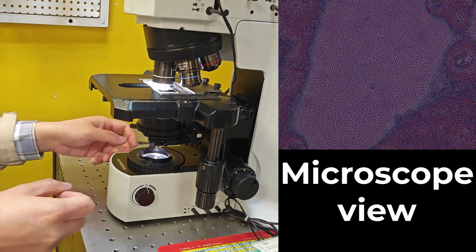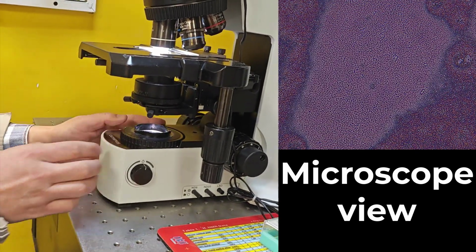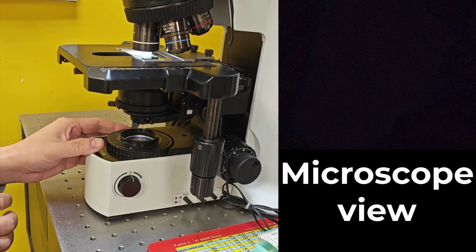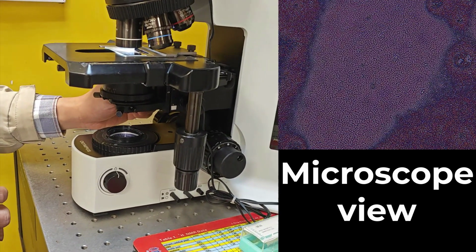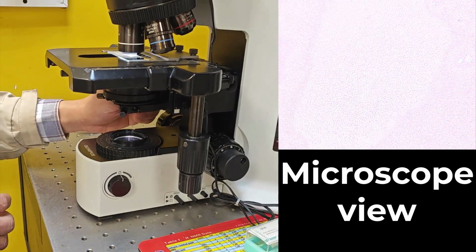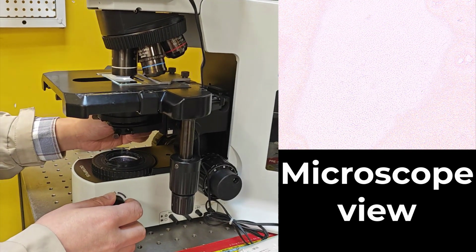the inappropriate illumination setting. The first thing you want to adjust is reduce the aperture all the way to the smallest at the bottom, and then gradually adjust the condenser position closer to your sample. This will make the field of view very bright, so you may want to adjust the light intensity accordingly.